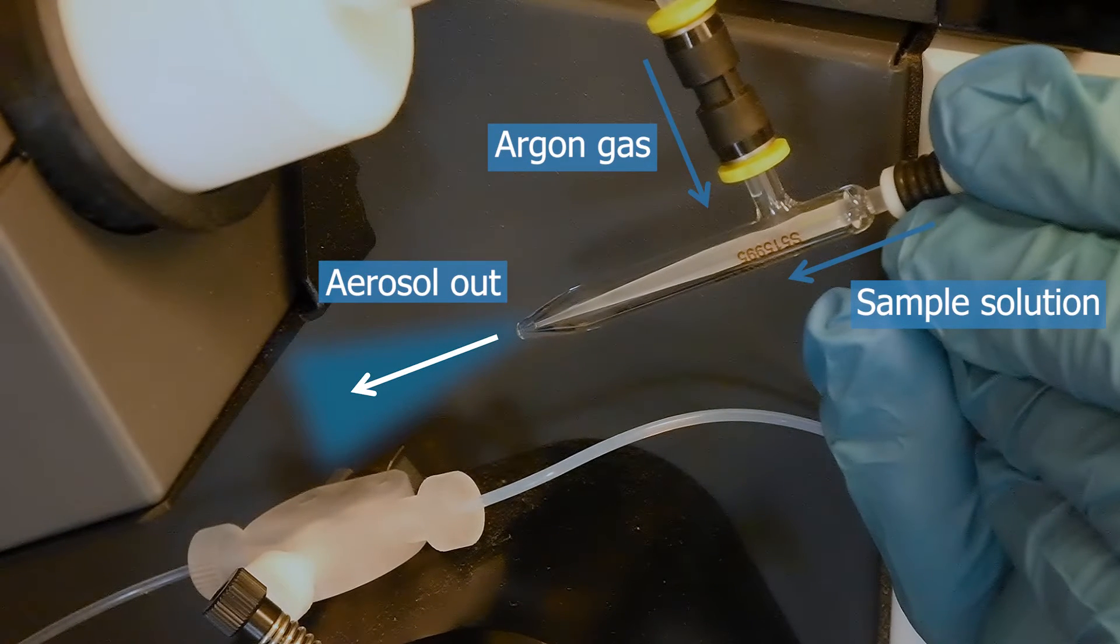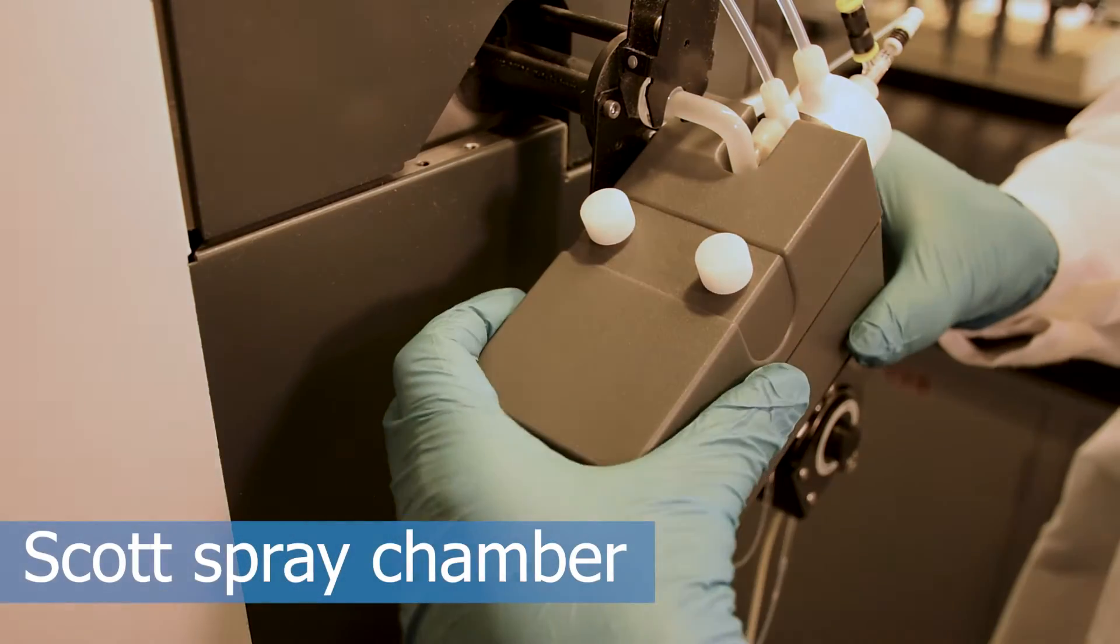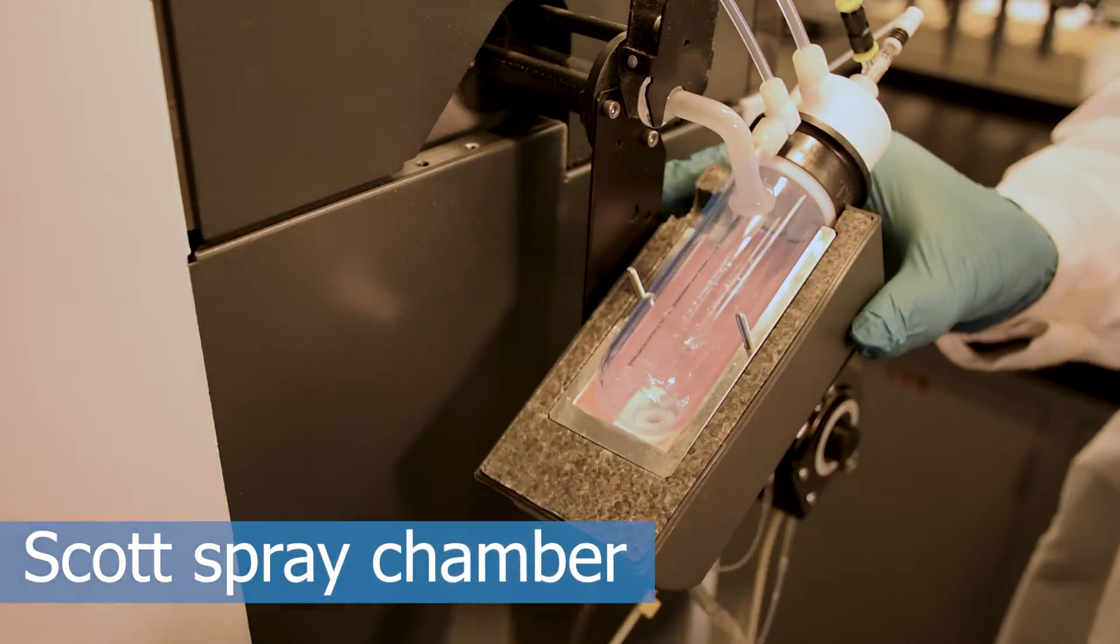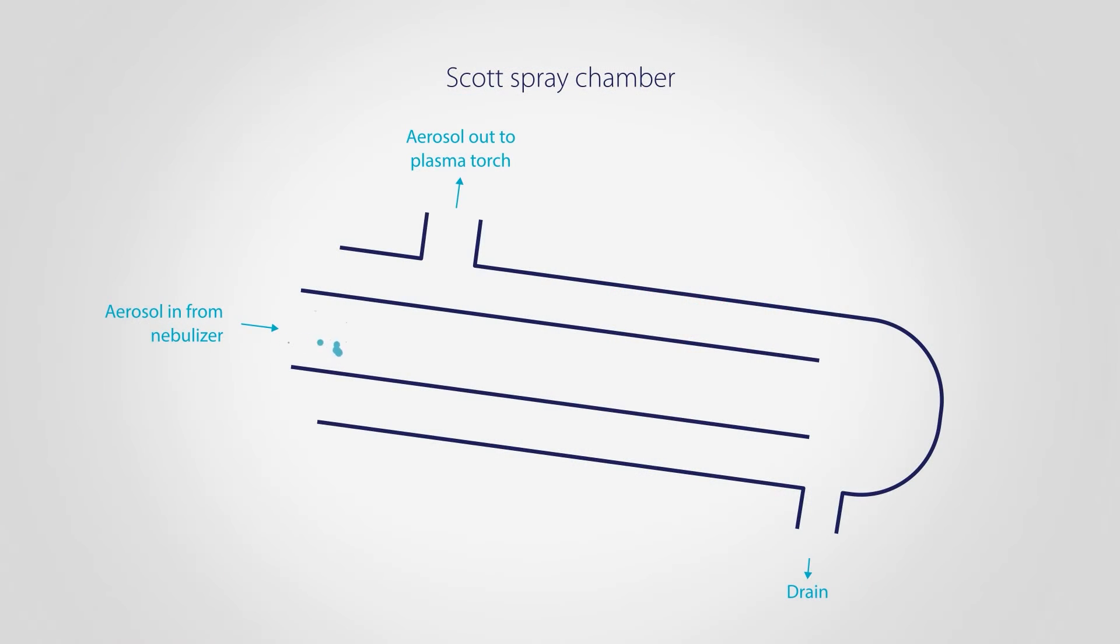The aerosol proceeds into a spray chamber. All ICP-MS use spray chambers. This one uses a design called a Scott spray chamber. The aerosol enters the chamber and larger droplets collide with the spray chamber wall, where they then drain away.